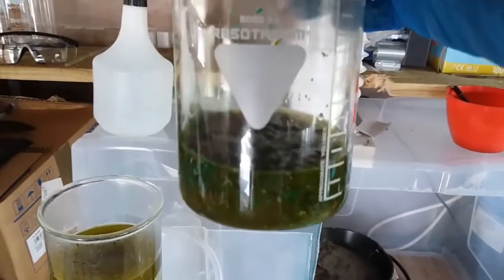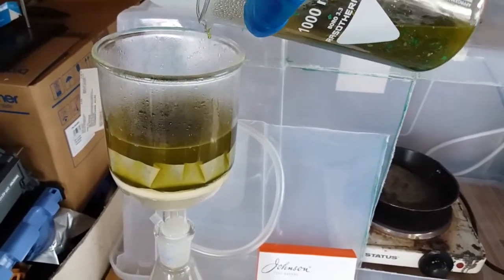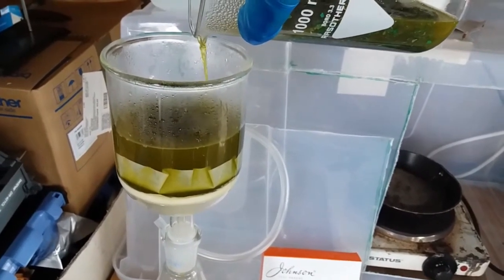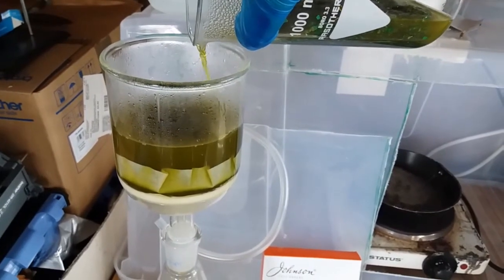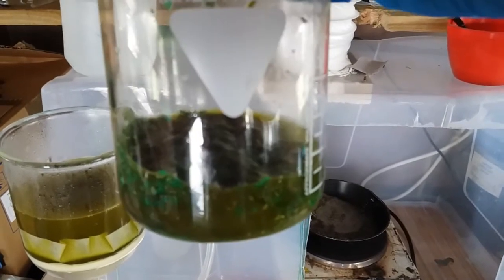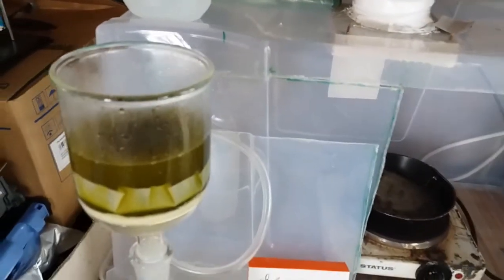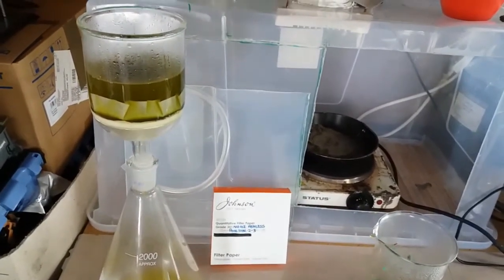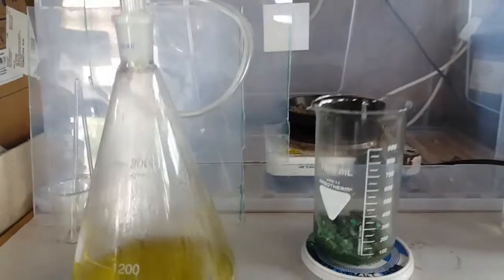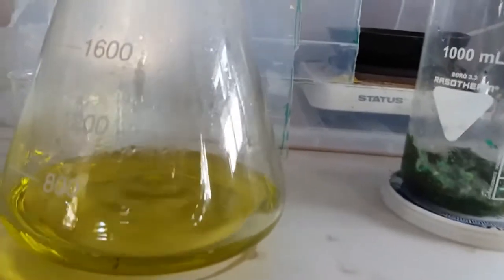The key when you're starting your filtering — if you have a lot of junk in there to clean — is to filter through the liquids first. When you have all the liquids through, you can put in your junk and then wash it through with water. The key is not to fill your filter up with the junk first, otherwise it'll delay things and you'll be waiting ages to get a nice clean solution. That's what I do anyway.